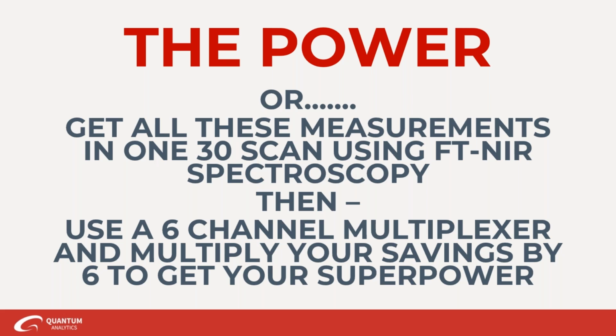Nice. All right, so another question that came in: is it possible to use online NIR to monitor and control the curing process for UV activated resins? I would think so. I mean, the resin manufacturing, we saw one of those earlier, and you're sort of measuring the same things.